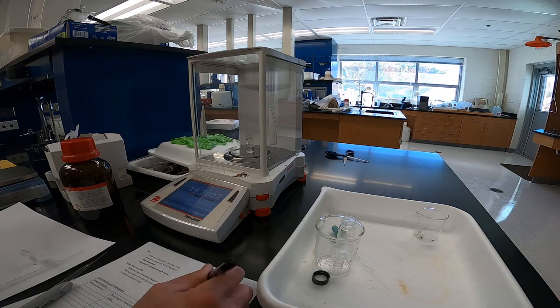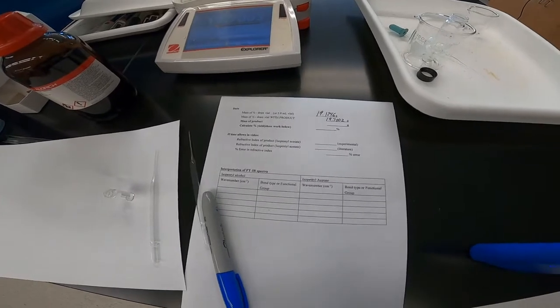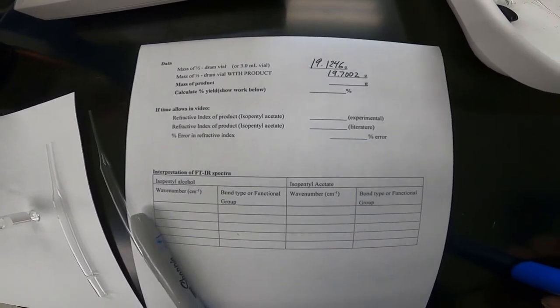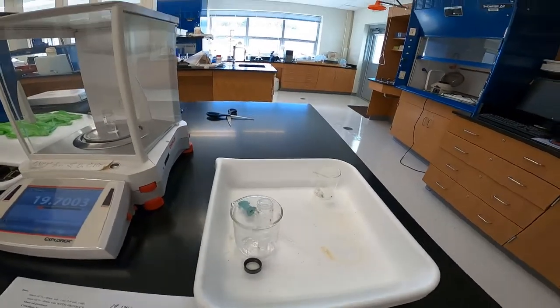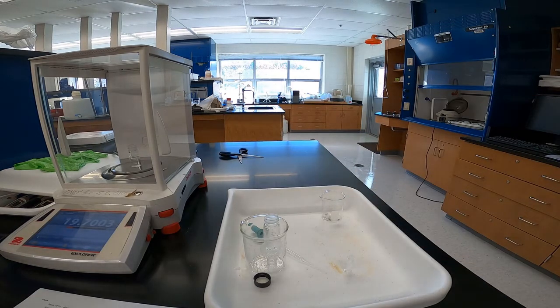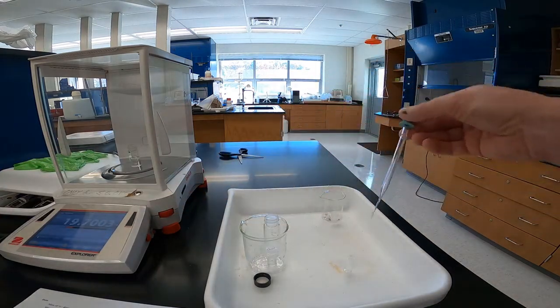So we have a total, the vial itself weighed 19.1246 grams, and with the product it's 19.7002 grams. So what I'm going to do next is I'm going to prepare a small vial of sample for injection into the mass spectrometer.